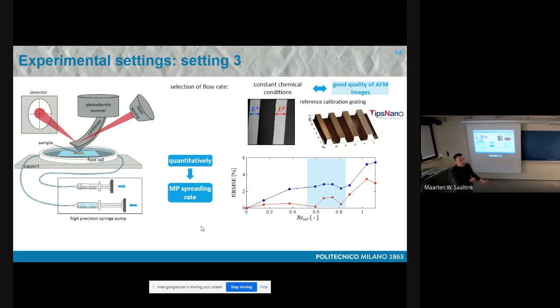Yeah, we measure relative rate because there is not much else that we can do without a reference mask. That's unfortunately the point with the first one. But of course, since we were interested in increments, we were interested in fluctuations, we thought it was good enough at least to start working and interpret that. In terms of, I don't understand what you mean by changing the solution.